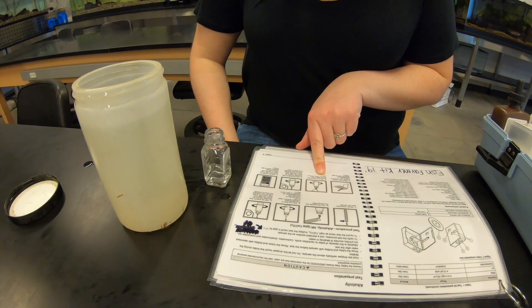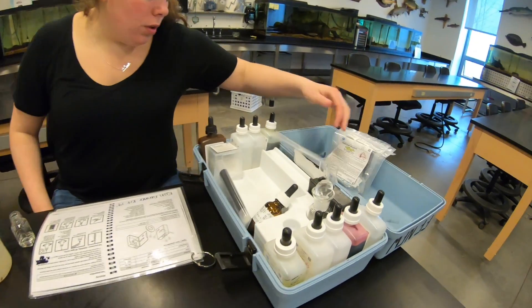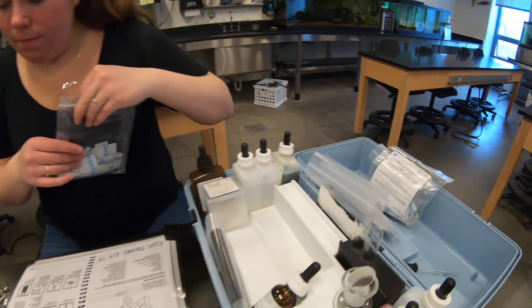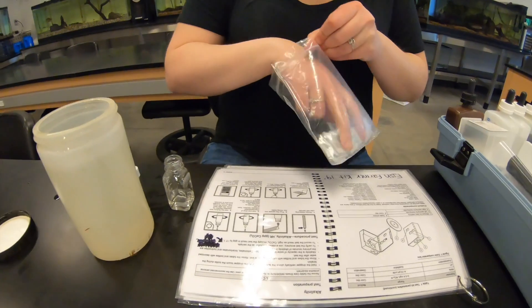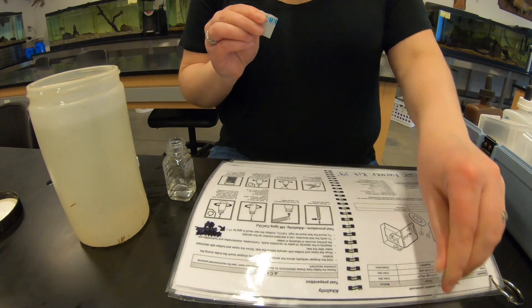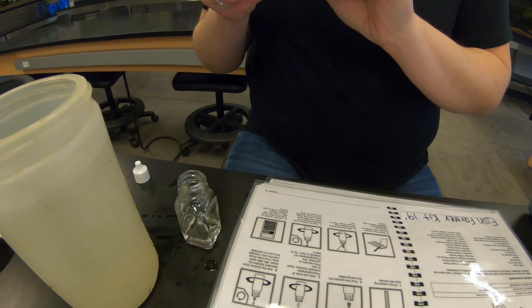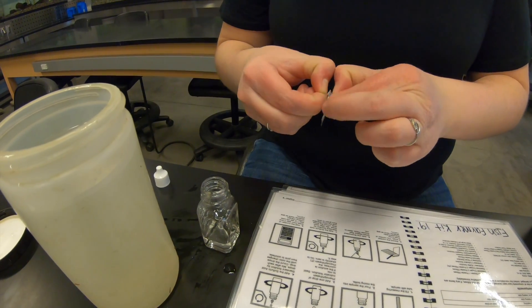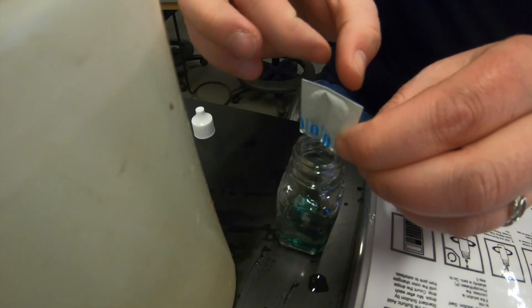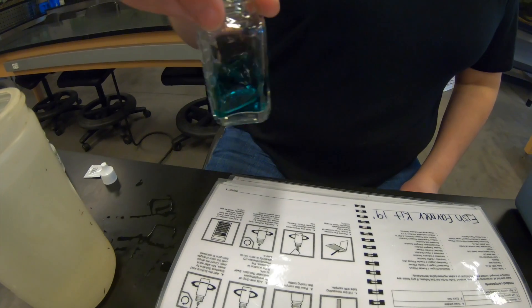Step six is to add one bromocresol green methyl red indicator pillow packet and swirl to mix. It has a little tear tab right here. We're going to pour that in - make sure all of it's in there - and now our solution is a green color.